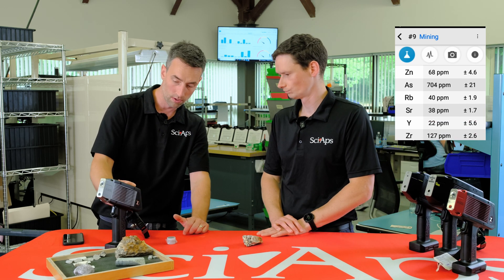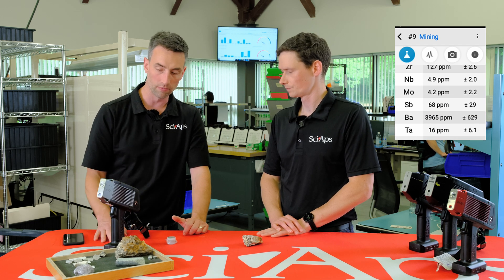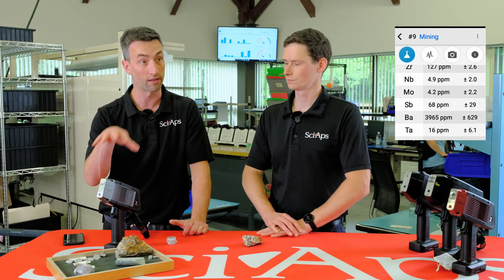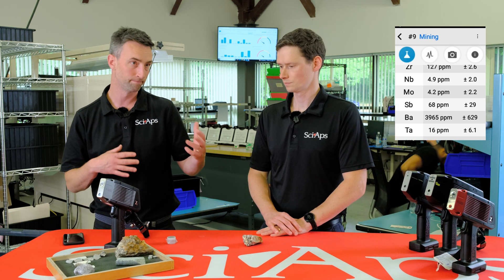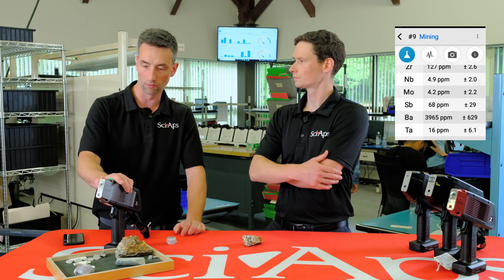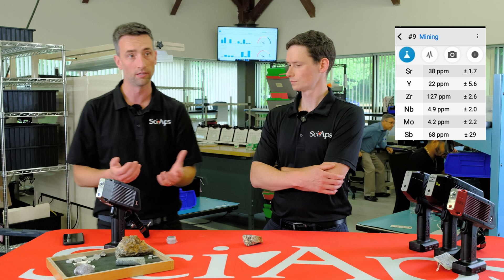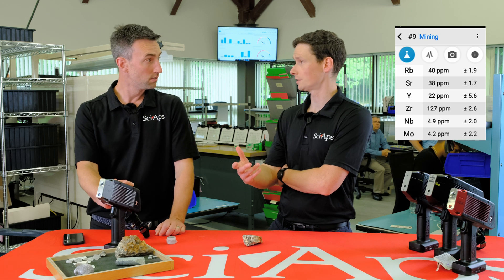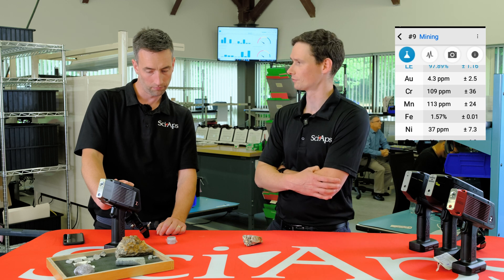We've also got arsenic and zinc — there are some gold pathfinders in here that you would also look at. Typically the way people use XRF for gold exploration is that they use pathfinder elements — elements that have a tight correlation with gold. That might be silver, might be arsenic, or base metals; there's a whole bunch of them depending on the deposit type. But now you get gold as well, and it's sort of another layer of confirmation of the presence of gold. So even though gold can be tricky, it's not the only thing you can look at if you're actually mining or exploring for gold.